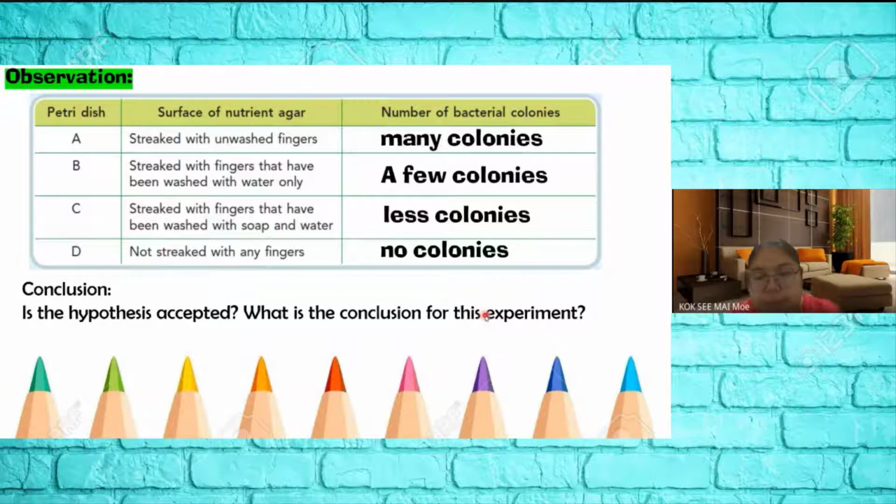We get that when the clearness level increases, the growth of the bacteria should be more or less? If I say decreases, yeah, correct. So you can reverse it. You can say when the clearness level becomes low, the growth of the bacteria will increase.